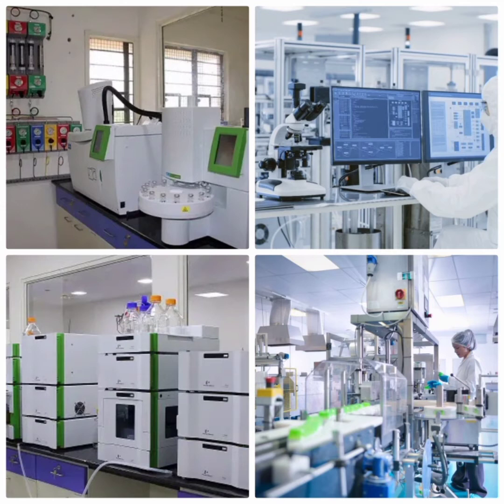Let us talk about the comparison based on detection principles. HPLC detection is commonly based on non-destructive detection such as UV, RI, photodiode array detectors, conductivity, and laser detection.